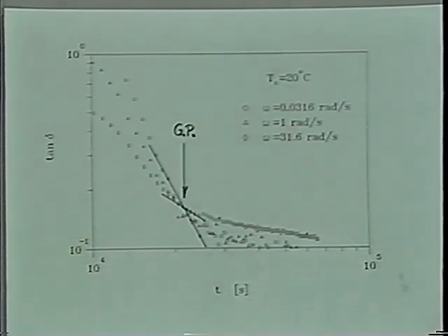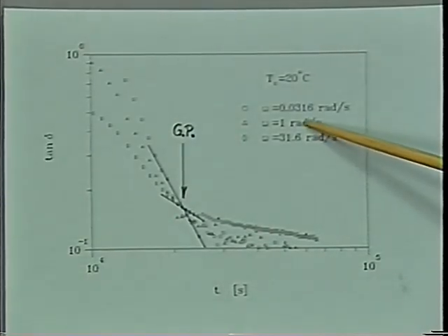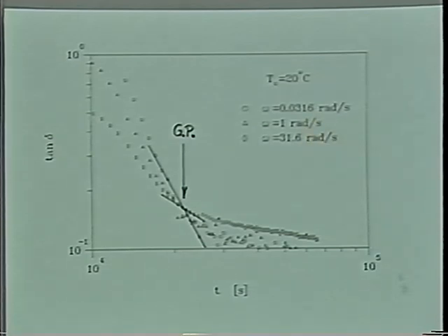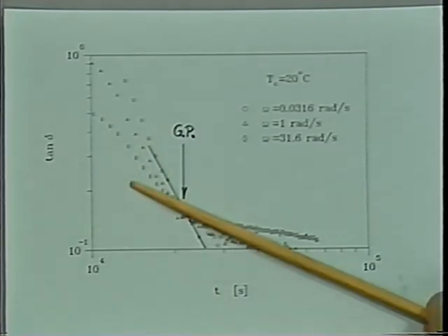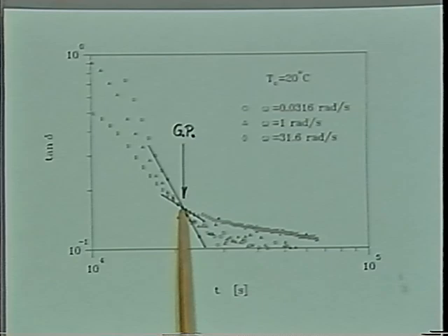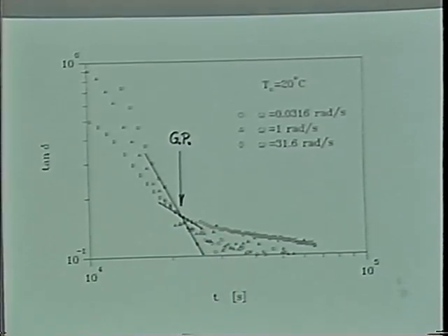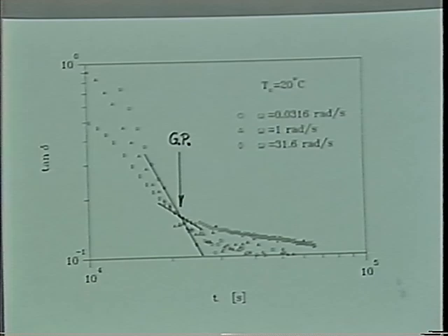For crystallization at 20 degrees C, the tan delta again decayed as expected in our experiments. Now omega wasn't changed over such a wide frequency range. It's 30. But again, we can use tan delta, put a tangent to those curves, and then get the gel point directly. You can see a very nice evolution in the liquid state, but then in the solid state, some more things are happening probably as we move further beyond the gel point. Maybe the crystal lamellae or whatever interesting morphology is coming in.